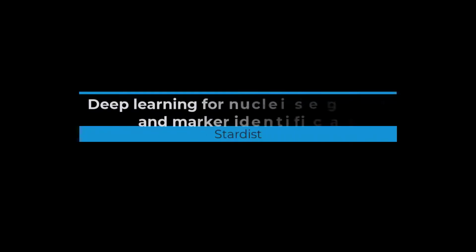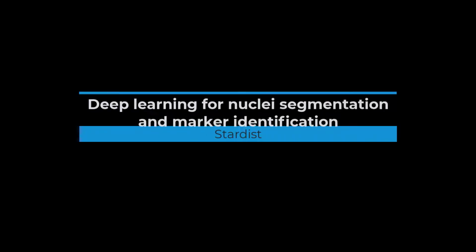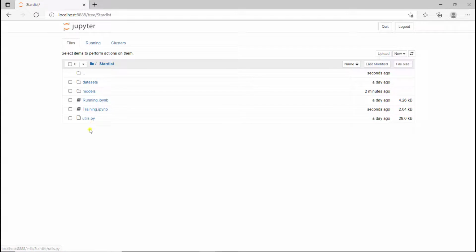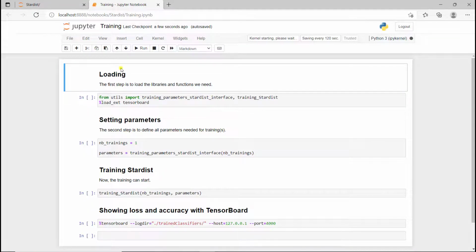In this video, I'm going to show you how to train and process a Stardist model. So here we are on Jupyter Notebook at the GitHub folder root. So I'm going to click on Stardist and I'm going to open the training notebook. So again, everything is organized the same way.